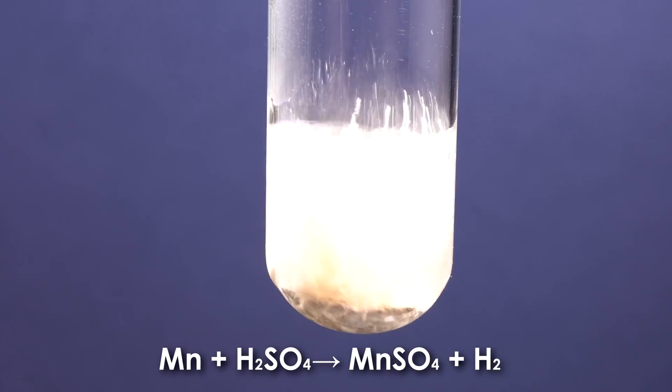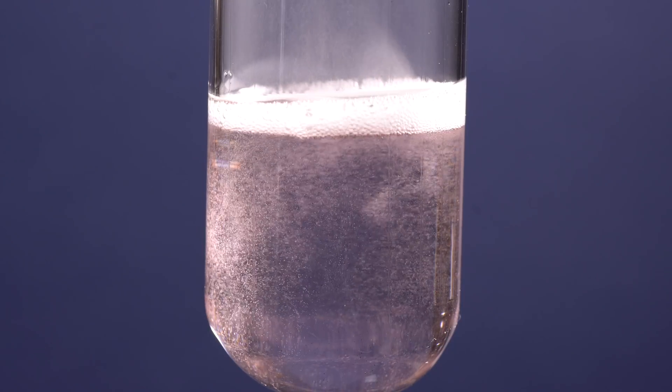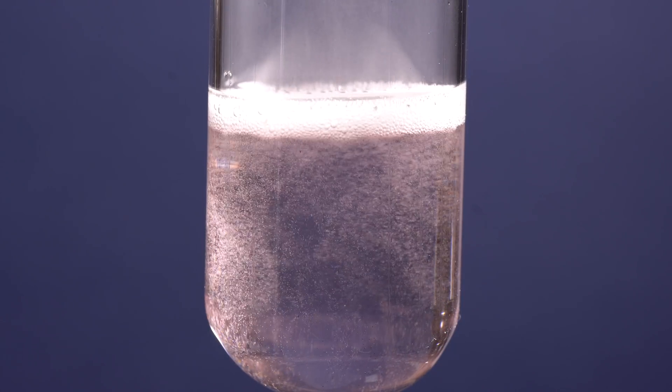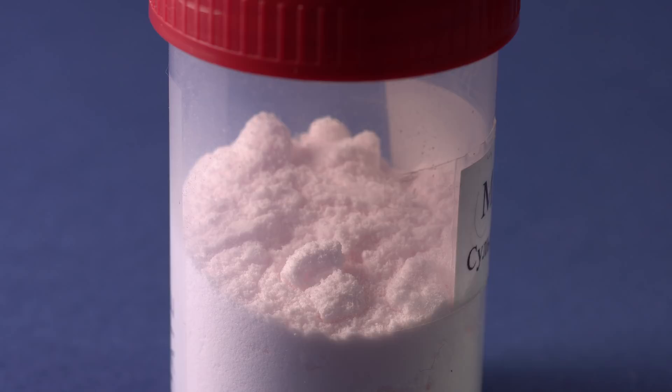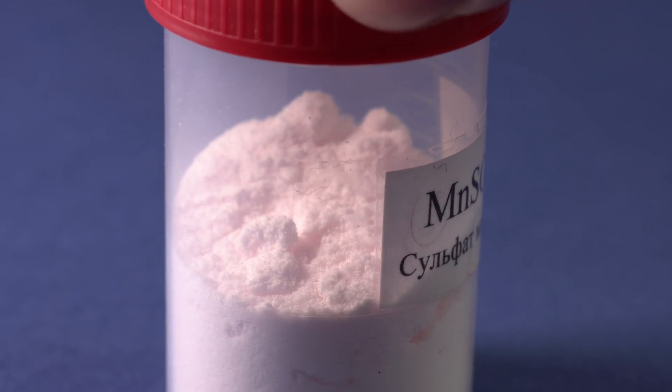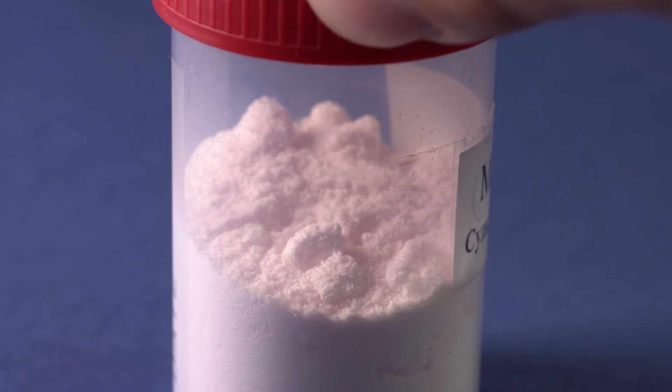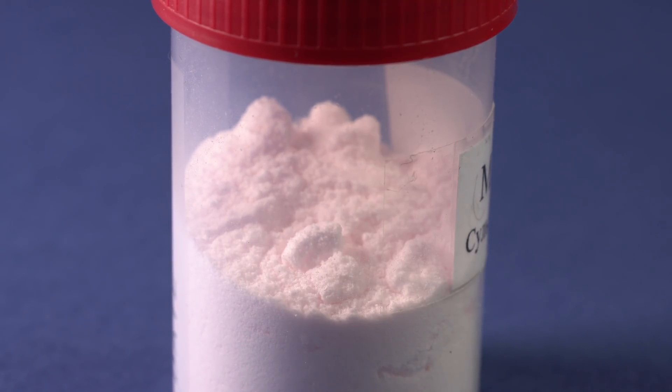The metal manganese reacts well with acid. With sulfuric acid it forms hydrogen and manganese sulfate, which has a light pink color. In its solid state, manganese sulfate is a white powder with a pinkish shade. When there is a shortage of manganese compounds in a human body, it is prescribed as a medicine.